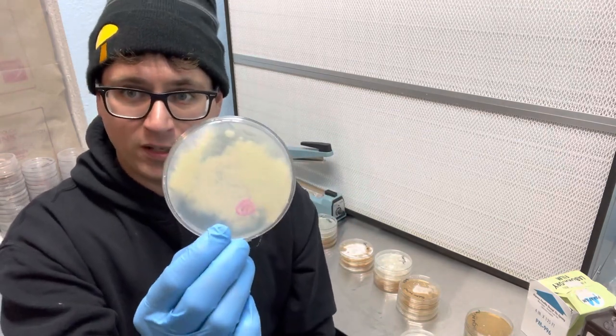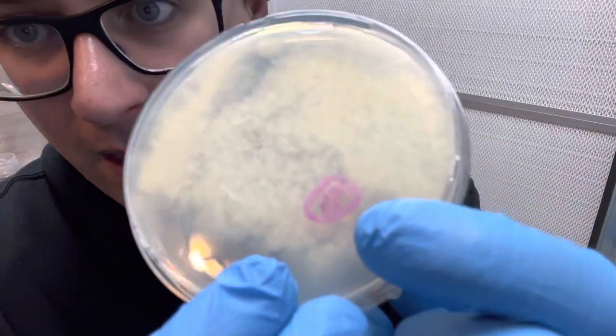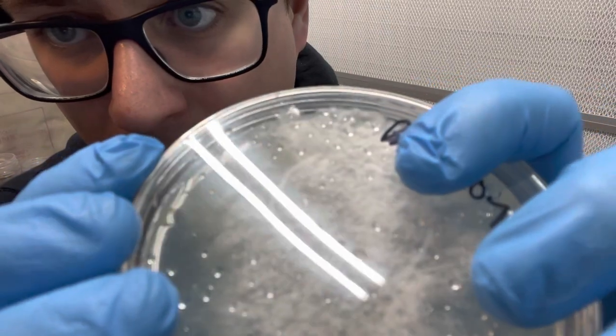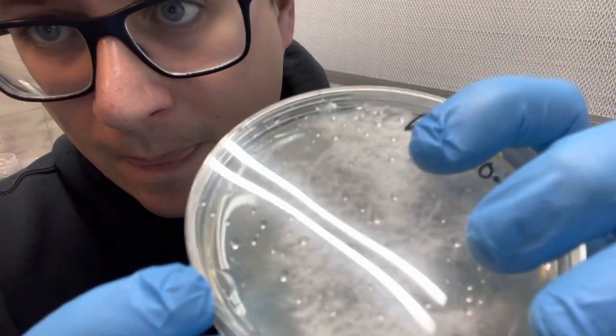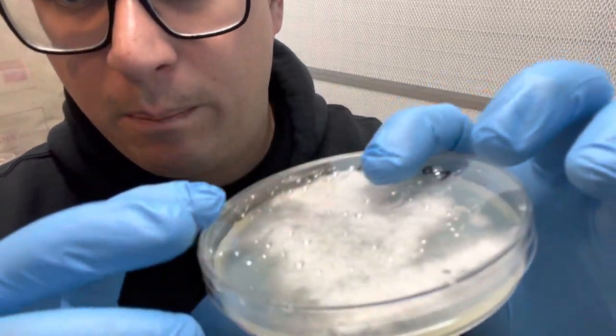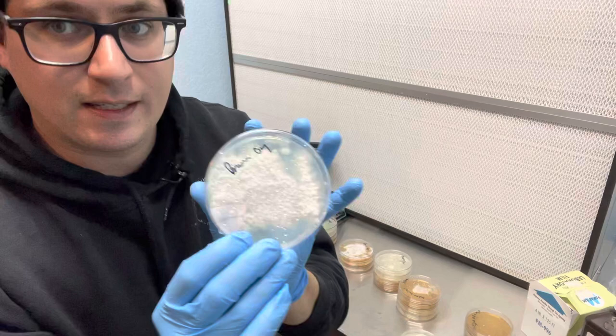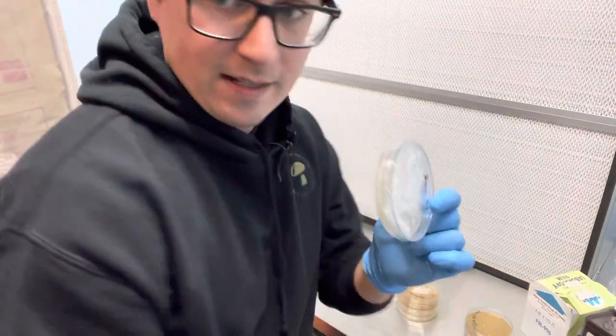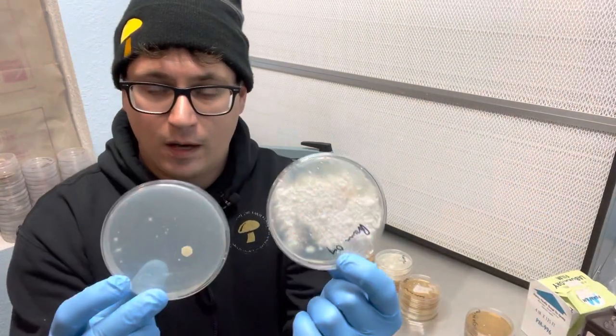When these spores first developed, I marked on my petri dish where that bacteria colony was. If you look closely, you can see the region right here which is a little bit discolored. If I didn't mark that and I looked at this plate about two weeks later, it would look perfectly healthy. So that's the importance of marking your contamination and observing your plates while you're growing from spores.